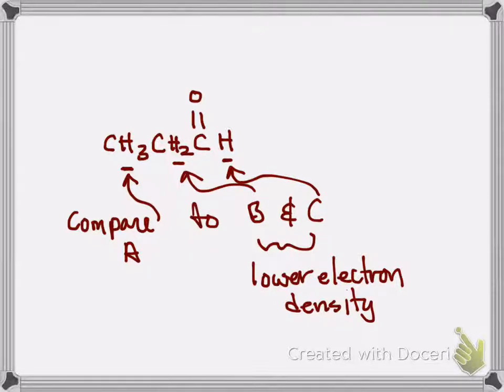So the higher spin is what gives them a higher frequency. It's not the higher spin, it's the higher separation in the spin state energies. So you have the go-with-it spin state, and you have the go-against-it spin state. And the energy between those two gets bigger because the magnetic field changes. Okay? So when you're looking at an NMR spectrum and you see peaks that are shifted downfield really far, you know they're against an electronegative group, in proton NMR.